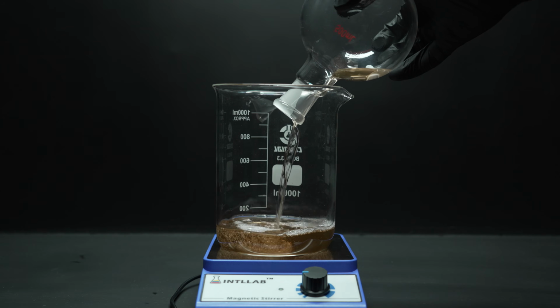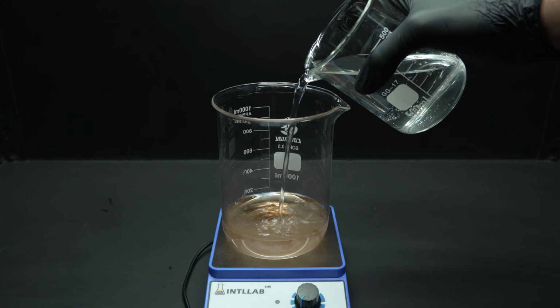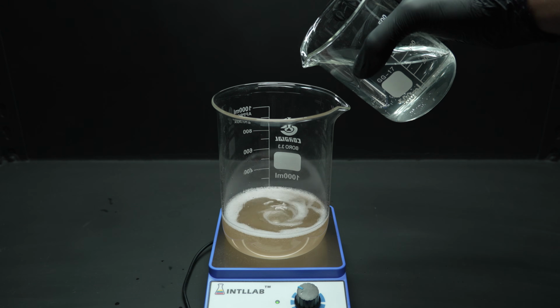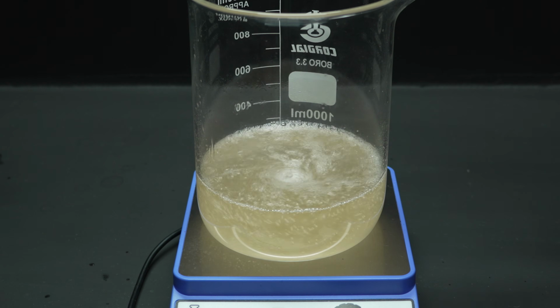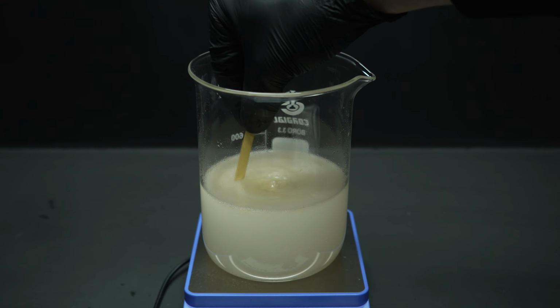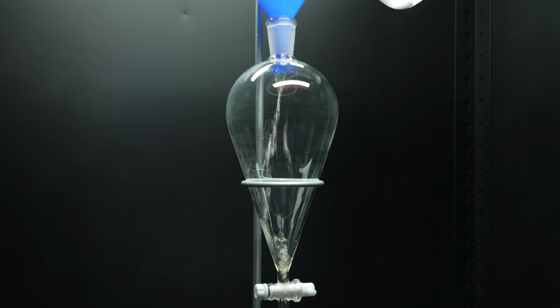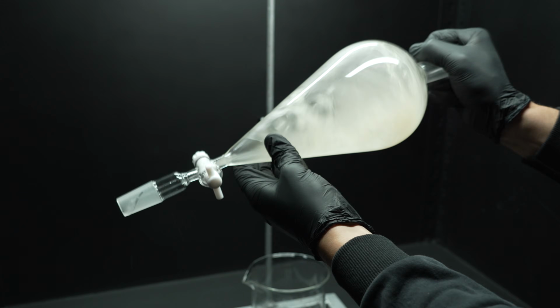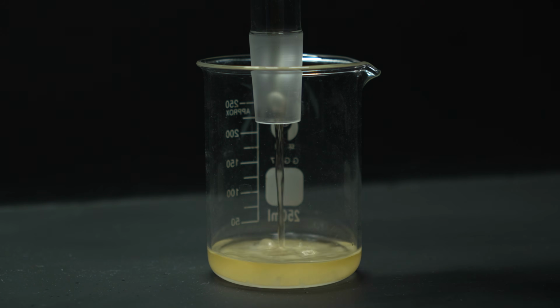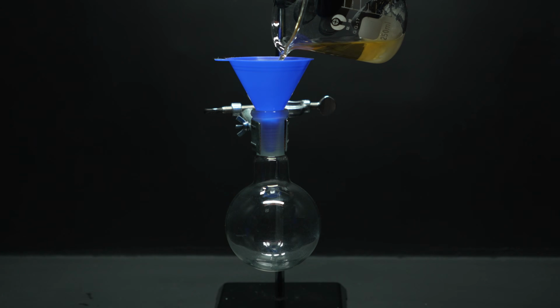When it finished, I let it cool down, poured everything into a beaker, and prepared some baking soda. So yeah, we're about to do the hardest experiment in chemistry, mixing vinegar with baking soda. In short, I needed to neutralize everything because we used an excess of acid. When the pH was neutral, I poured the mixture into a funnel and washed it several times with water and sodium carbonate. After that, I dried it over sodium sulfate and prepared to distill.